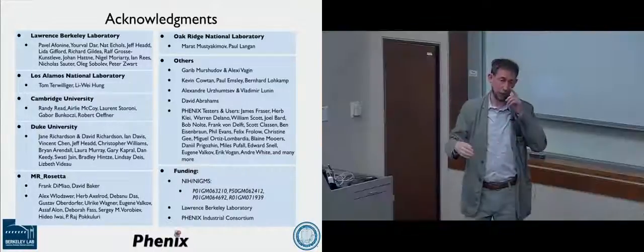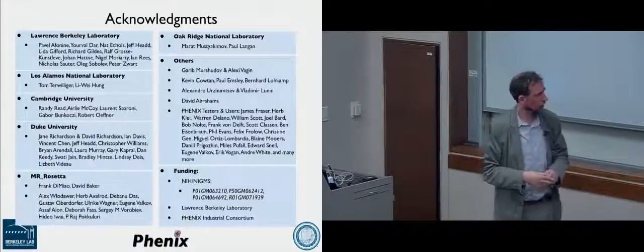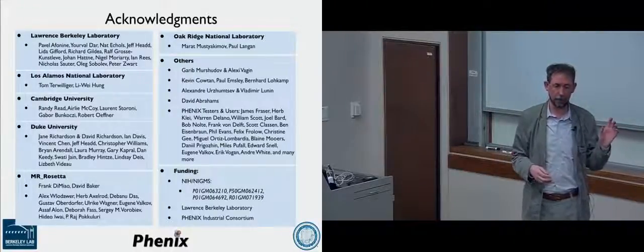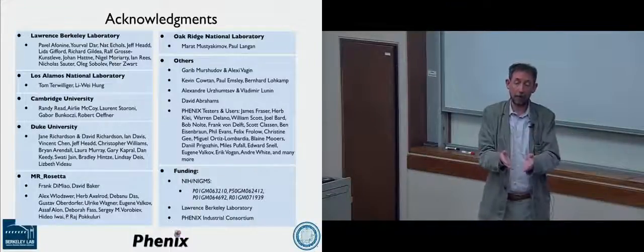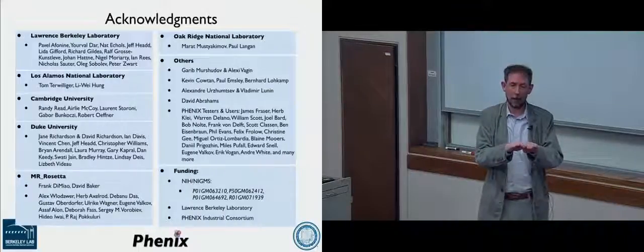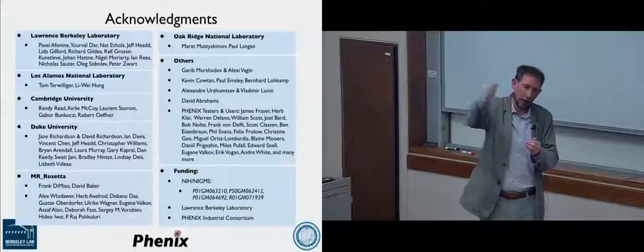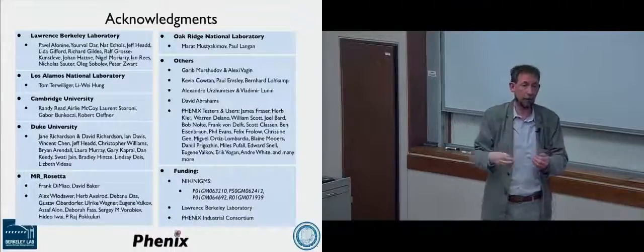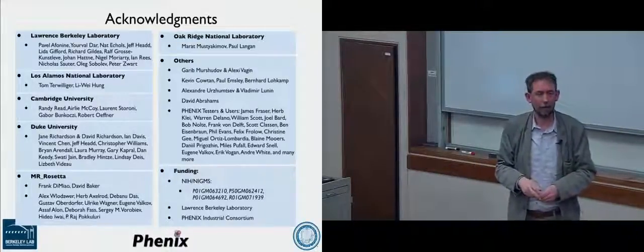That is not successful, generally. Otherwise, that's what we'd do. Especially the low resolution phases, conceptually, are very good. Well, I don't know how good they are. I suspect they're still quite poor, but they're certainly better than the high resolution ones, that's for sure. So conceptually, if we could take some reasonably okay low resolution phases and project to high resolution, that's what we'd want to do. But that's not been technically possible. If we could do that, it would be really great.